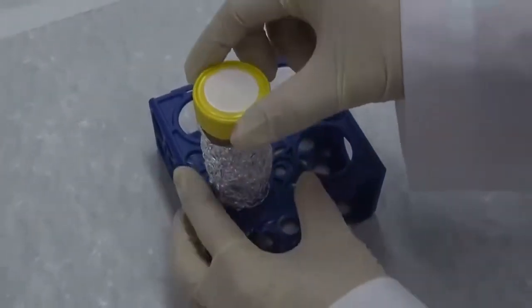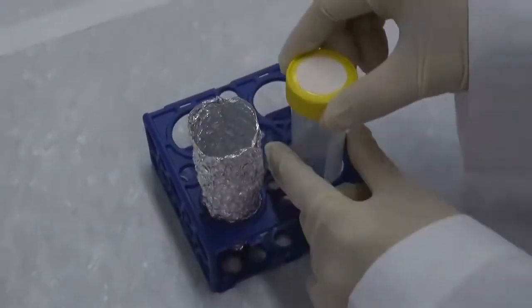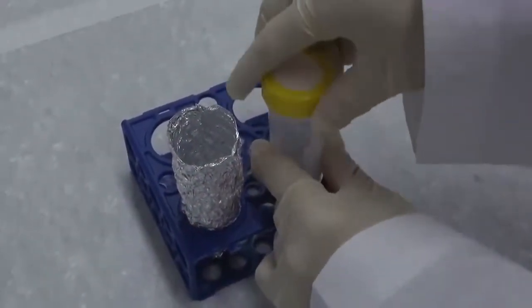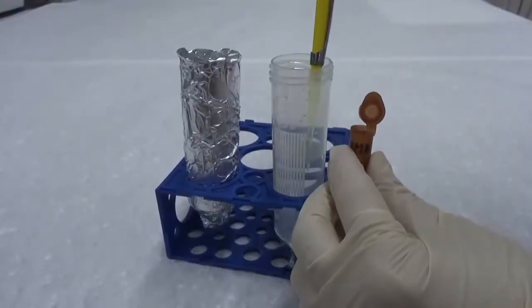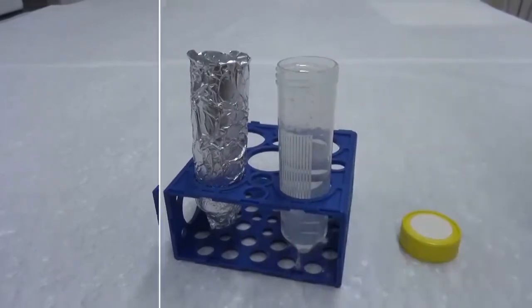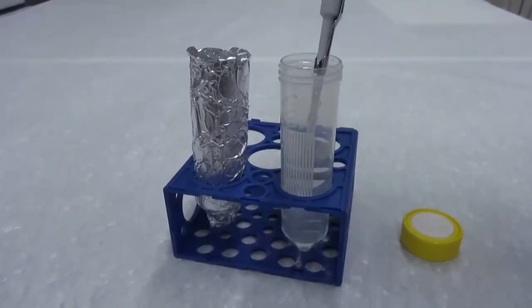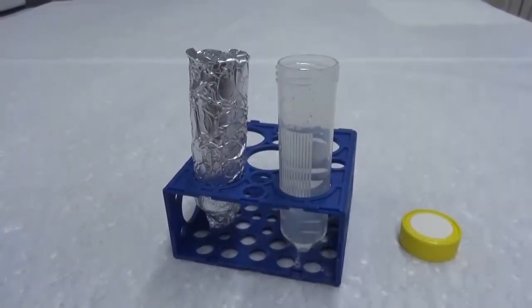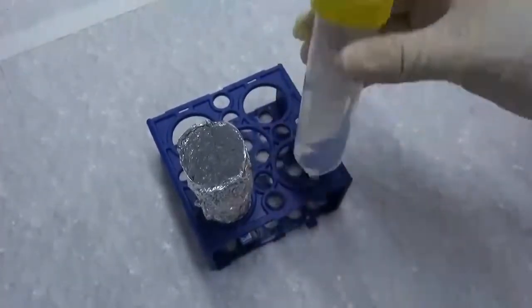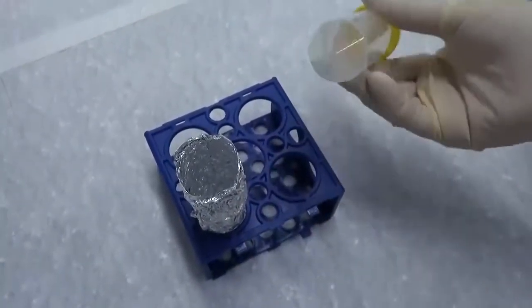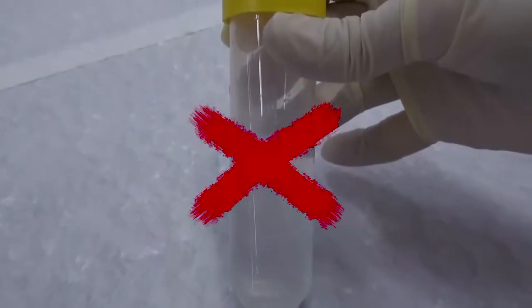To prepare the lower layer gel, take the centrifuge tube holding the lower layer gel solution and open the lid. Add proper volumes of TEMED and APS into the gel solution. When the temperature is low, the volume of APS may be doubled. Close the lid and gently invert the tube a few times to mix. Do not invert too hard. Otherwise, the SDS in the solution will generate bubbles which interfere with gel polymerization.